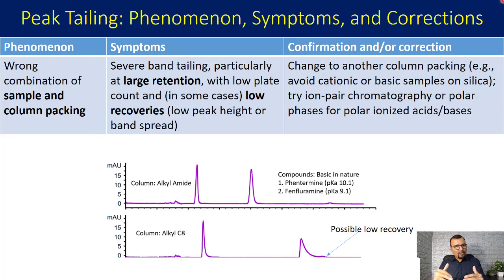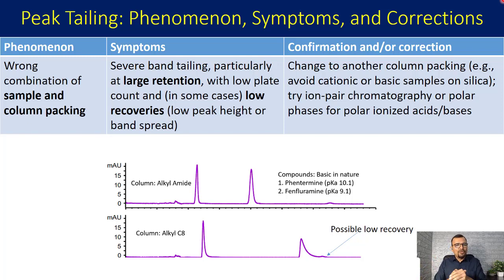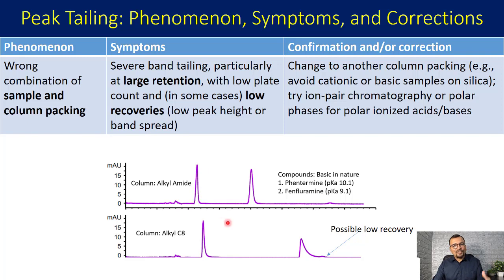In the chromatogram at the bottom, you will see that the alkyl C8 stationary phase is used and these two compounds are basic in nature. They have a significant amount of tailing, especially the late-eluting compound. There is also an impurity present on the tailing of the second compound, which is not having a good amount of response, so its recovery can get compromised. However, if the same sample is analyzed on the alkyl amide stationary phase, you will find the peak tailing has improved and the response for the impurity can be seen, so recovery for this impurity will be better.